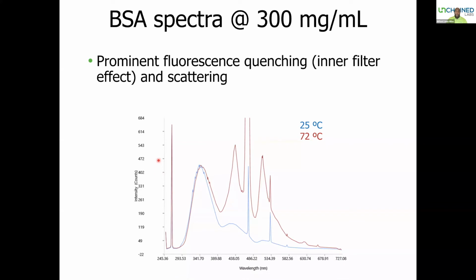Those are really, really low numbers. Typically, you would expect those numbers to be on the scale of 3,000, 6,000, 8,000, and even up to a few tens to hundreds of thousands, depending on the actual sample. And so when you're seeing things that low, it could be indicative that you have an inner filter effect happening, which typically means that only the surface of your sample is able to fluoresce light. The rest of it is simply trapped within the inner sphere, if you want, of the sample itself. It's a rather interesting process to be aware of because you may wonder whether it's impacting the actual data.